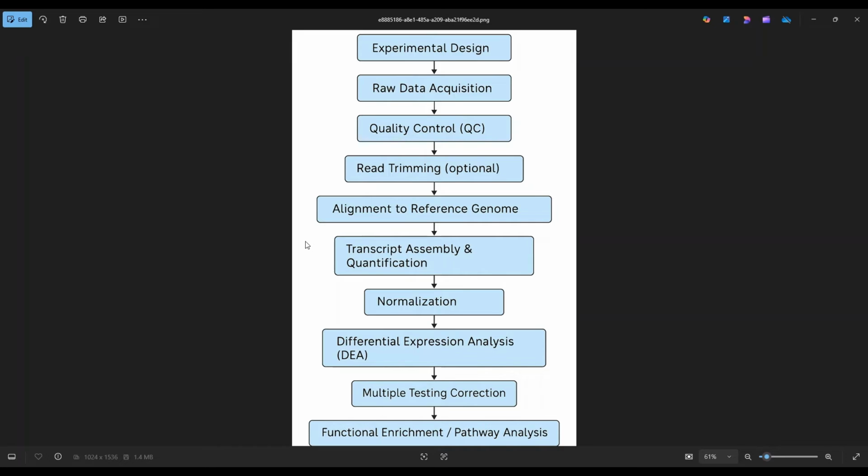For the sequence analysis, it's a very simple thing: you have a raw file and you don't know what is inside it. So what you do is compare it with the reference genome. All the reference genomes are available on NCBI, Ensembl and UCSC browsers, and you just have to download them. After downloading, you can see that there are multiple files. They also give you the annotation files along with the reference genome file, which you use for the sequencing.